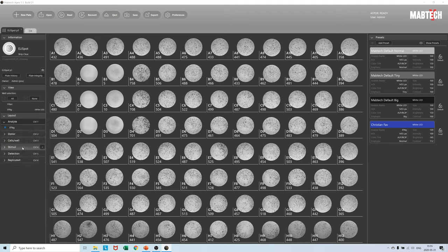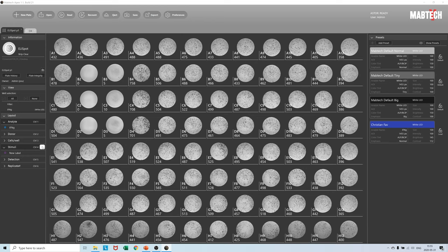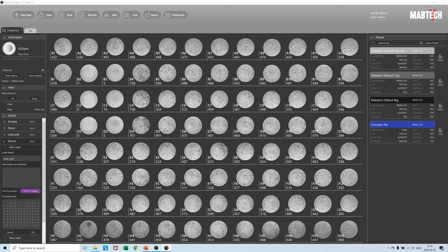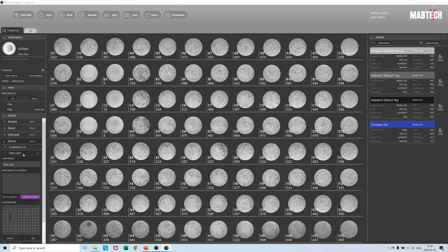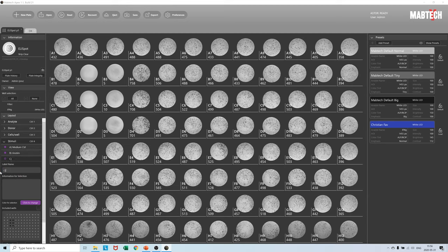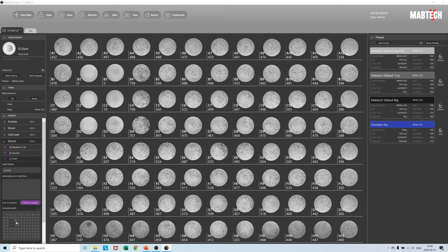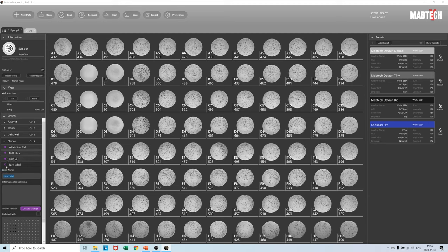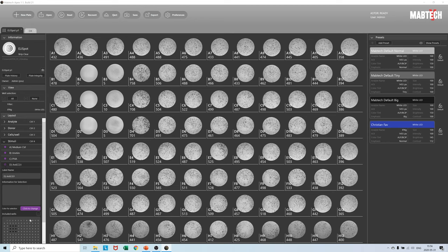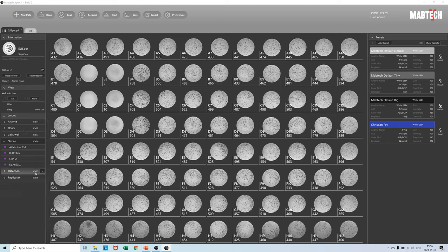Next stop is Stimuli and here we have four different combinations. I deliberately add in A, B, C, and D in the names for medium, unstimulated, PHA, and anti-CD3. We'll explain why a bit later.